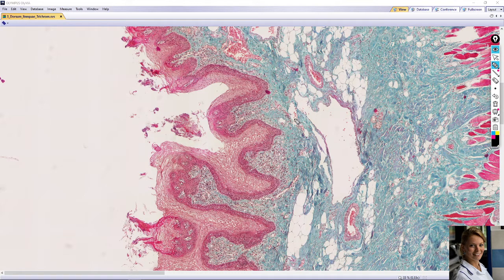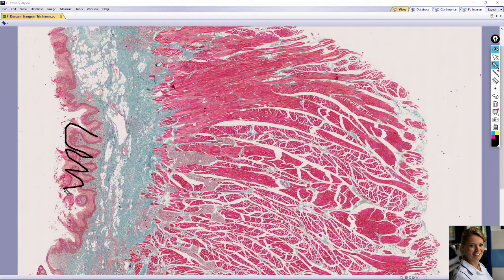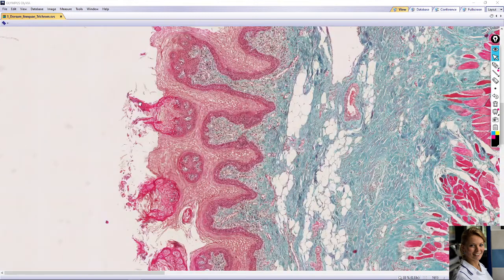The dorsal part of the tongue is rough due to numerous mucosal projections called papillae. Here is a papillae. This type is a filiform papillae. The tips of the filiform papillae show keratinization — you can see here on the top of this papillae it is very pink. Taste buds are not present in this type of papillae.